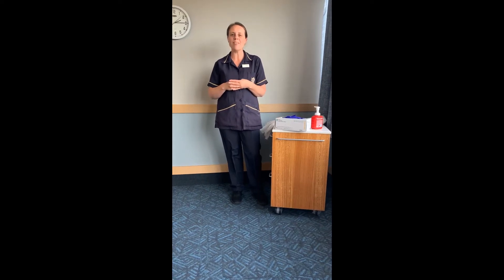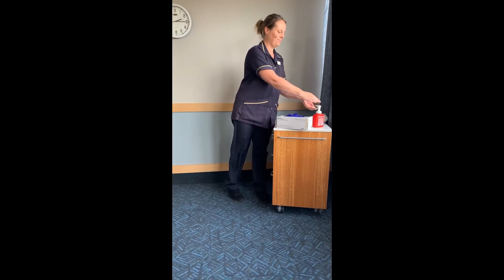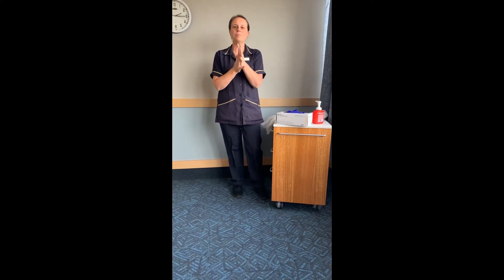Now I'm going to show you the safe use of PPE. Hayley will perform hand hygiene for 20 seconds before putting on her apron.